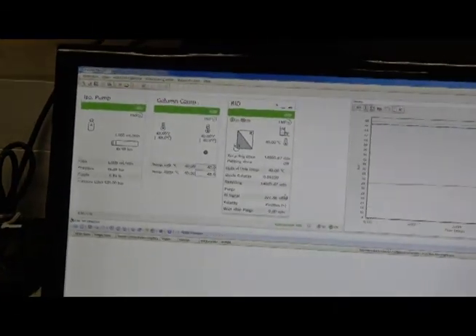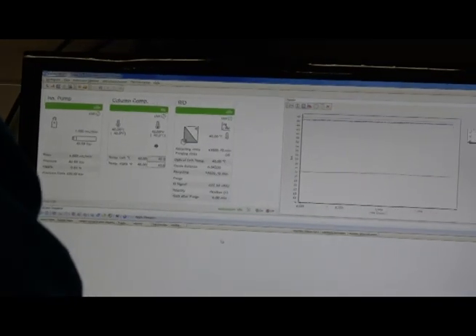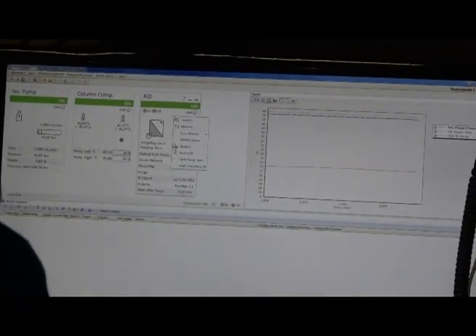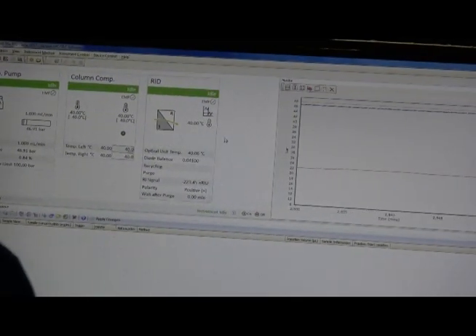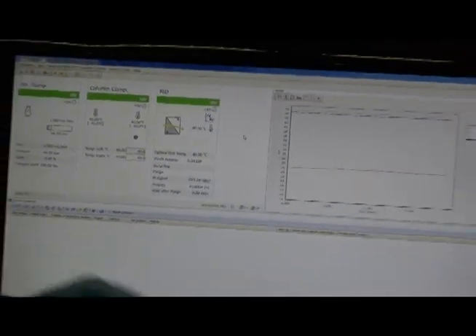The refractive index detector has been warmed and it's very stable. So now all we need to do is switch the recycling lock, right-click, switch recycling lock, and now we are going to do the injection.